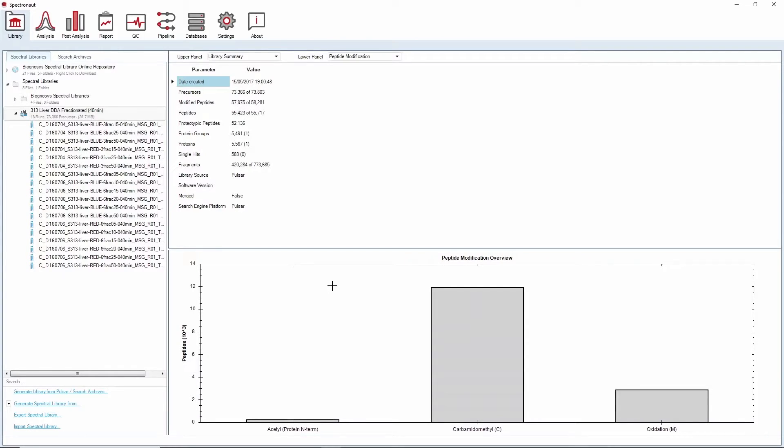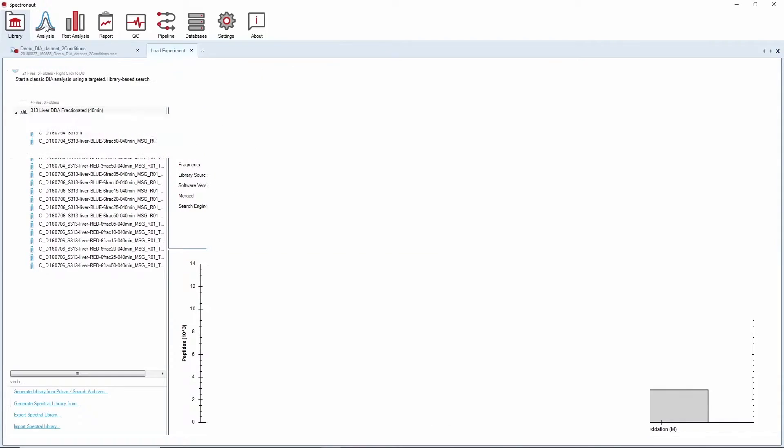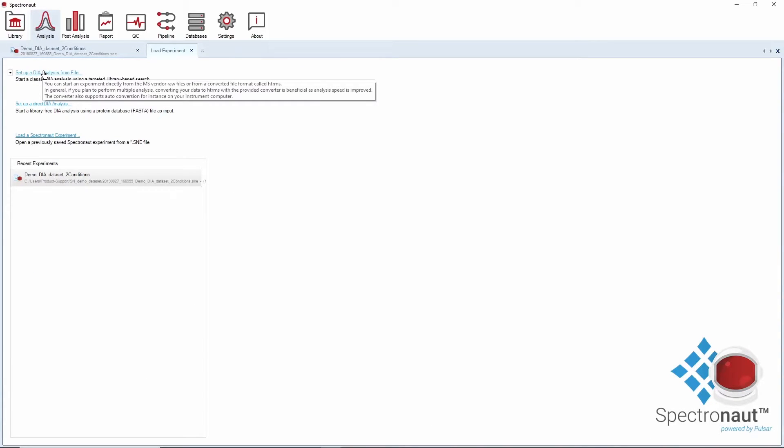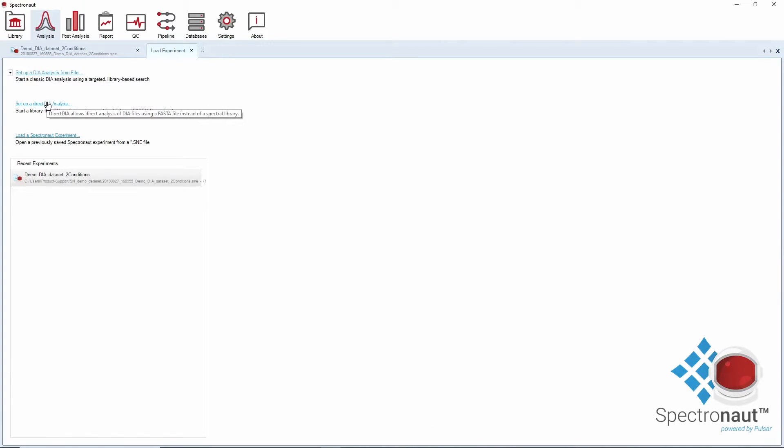If you are satisfied with your library, you can proceed with DIA data extraction. In the analysis perspective, you can set up a library-based DIA analysis and you also have the option to run a library-free DIA analysis with direct DIA.